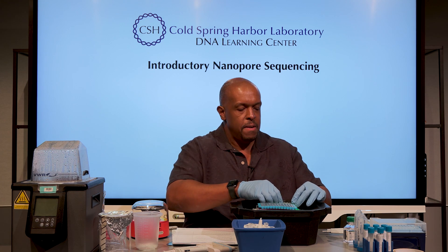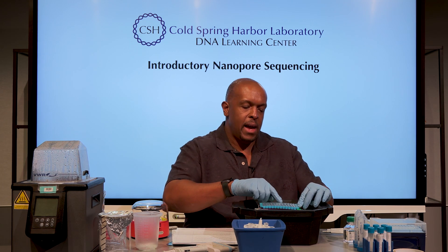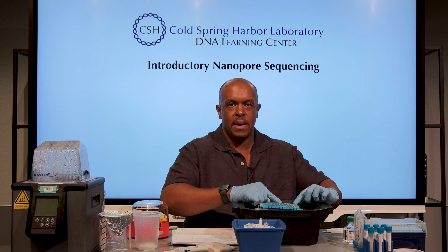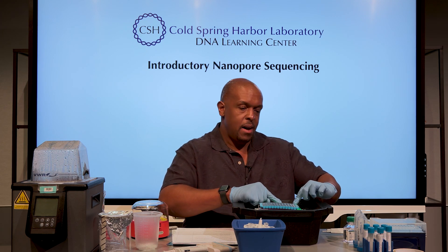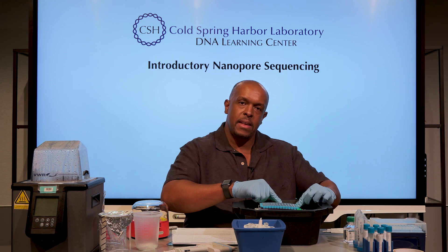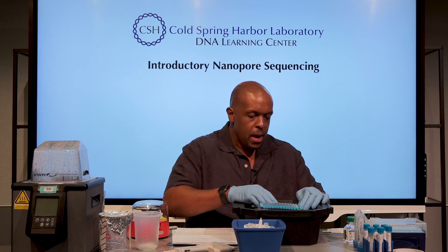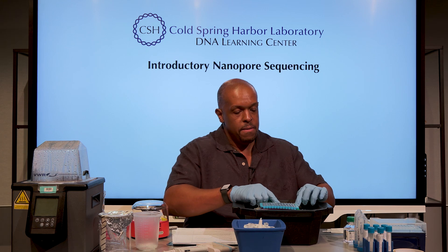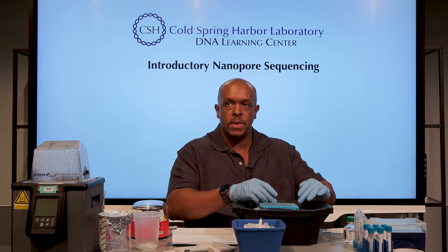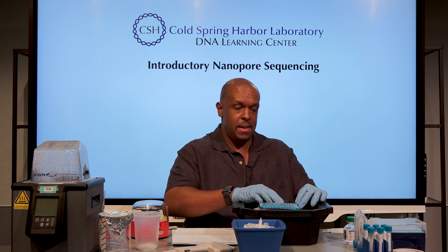The nanopore protocol says you're going to take strip tubes and you need 15 microliters of something at about 10 nanograms total. I've already laid things out. I have a control tube that is just water. I'm also taking advantage of the fact that I'm not processing that many samples — I'm going to test a different PCR polymerase setup. I have another set here that's slightly different, so I'm replicating things in a way you normally wouldn't have to do.